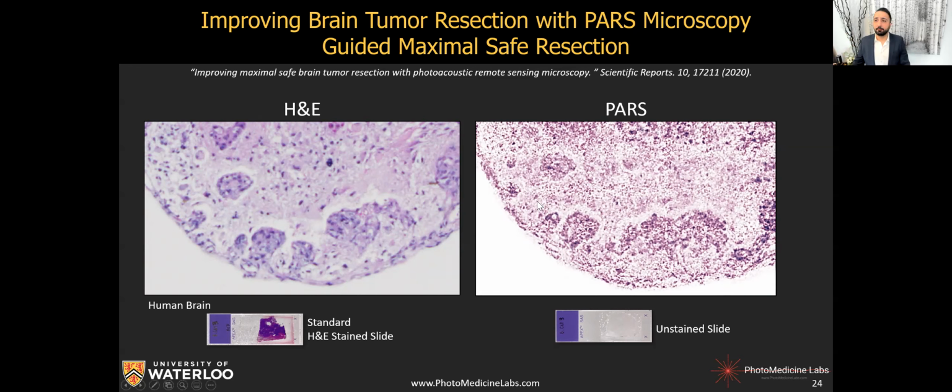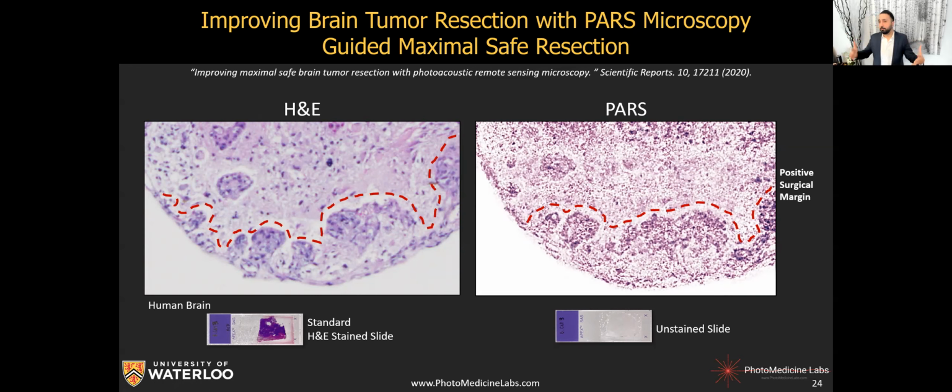So this is actually a very, very bad case, because here we are seeing a positive surgical margin. This is not the perfect way that it is defined in brain tumors, but for simplicity, let's call it a positive surgical margin. In other words, we see the cancerous area at the rim of this removed tissue. That means some of this cancerous tissue was left behind.